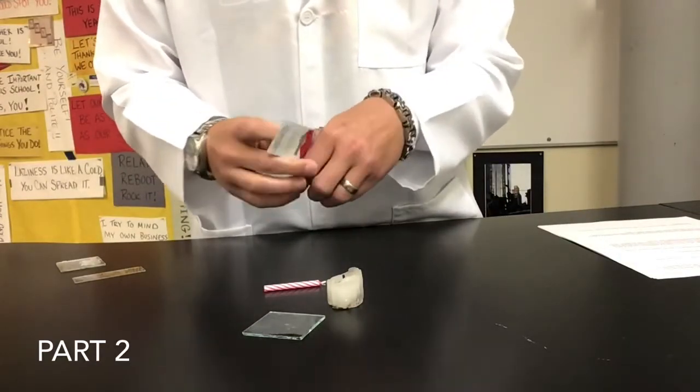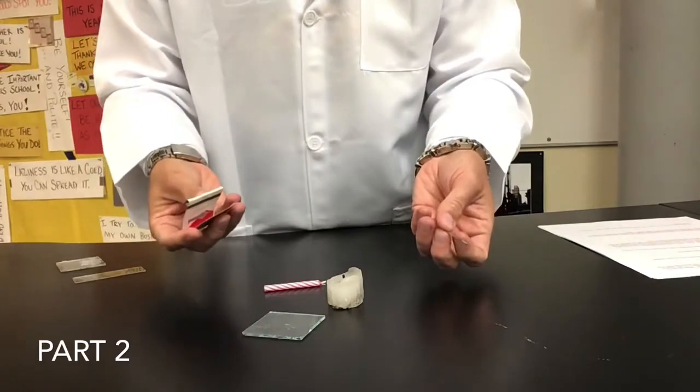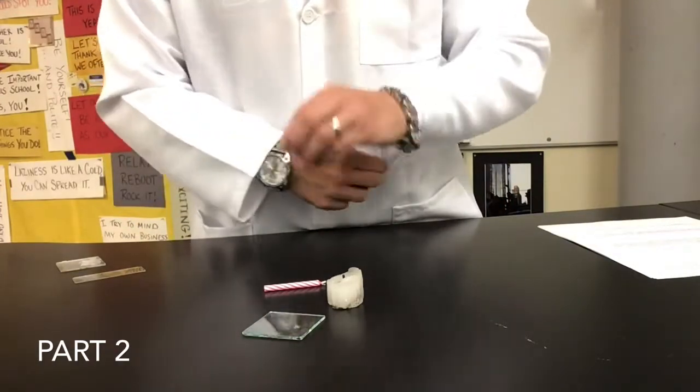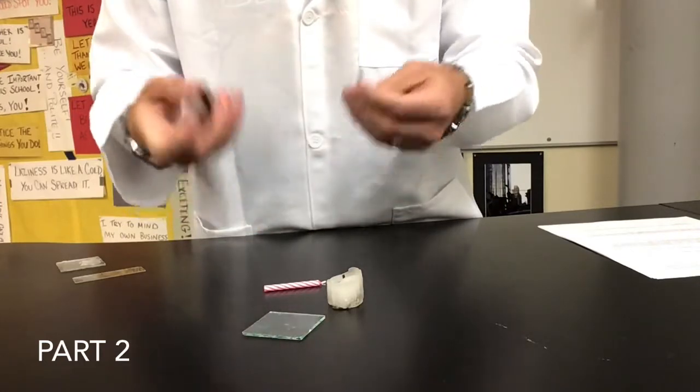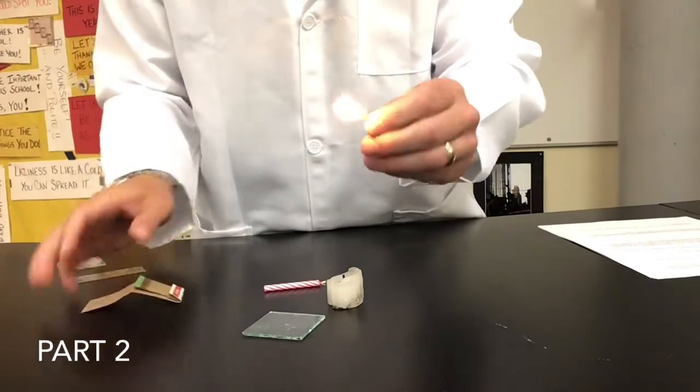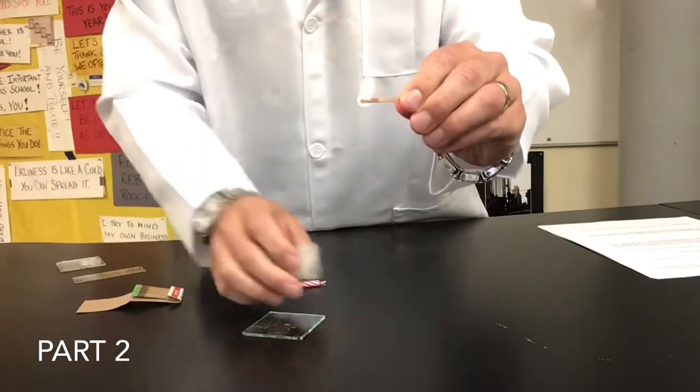As always, when we're dealing with an open flame, lab safety is a concern, right? So make sure that you don't have any loose articles of clothing that could easily catch on fire. Whenever you use fire in a lab, make sure that your hair is tied back. You don't want to start that on fire, all right? But so we have the match.